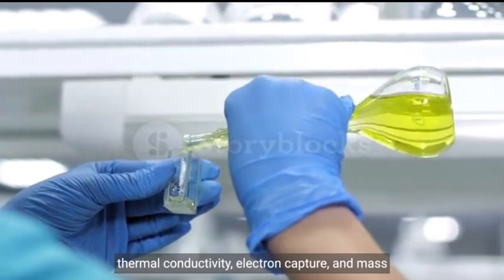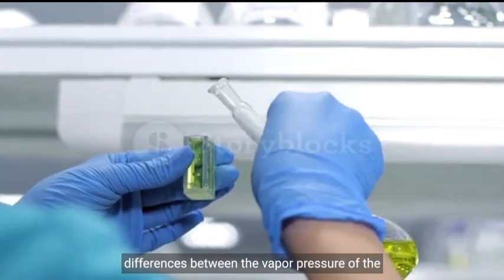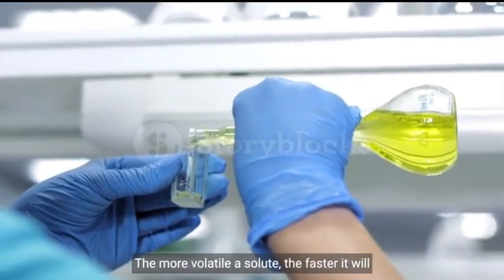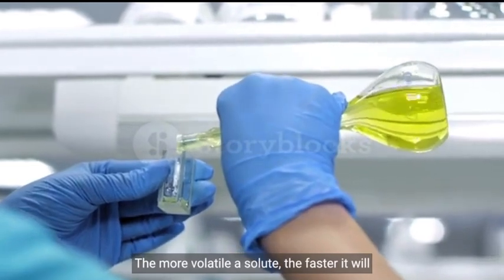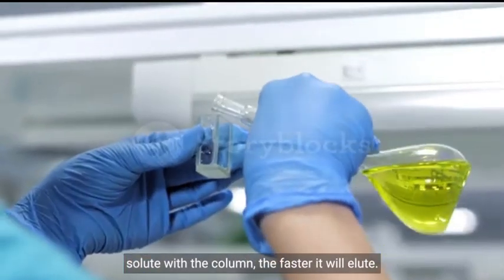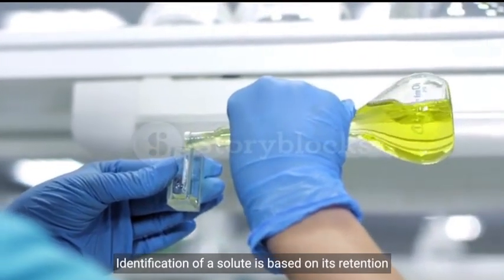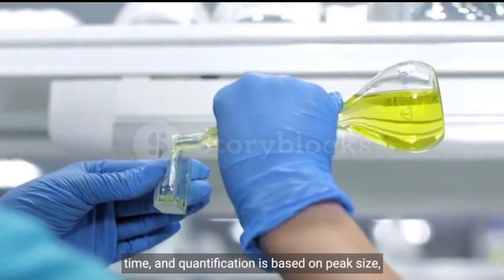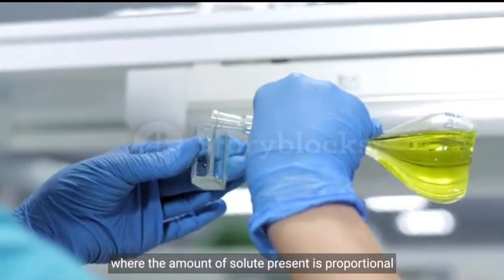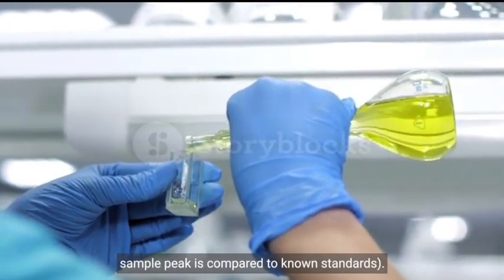Separation of solutes is a function of the relative differences between the vapor pressure of the solutes and the interactions of the solutes with the stationary column. The more volatile a solute, the faster it will elute from the column. The less interaction of the solute with the column, the faster it will elute. Identification of a solute is based on its retention time, and quantification is based on peak size, where the amount of solute present is proportional to the size of the peak. Area or height of the sample peak is compared to known standards.